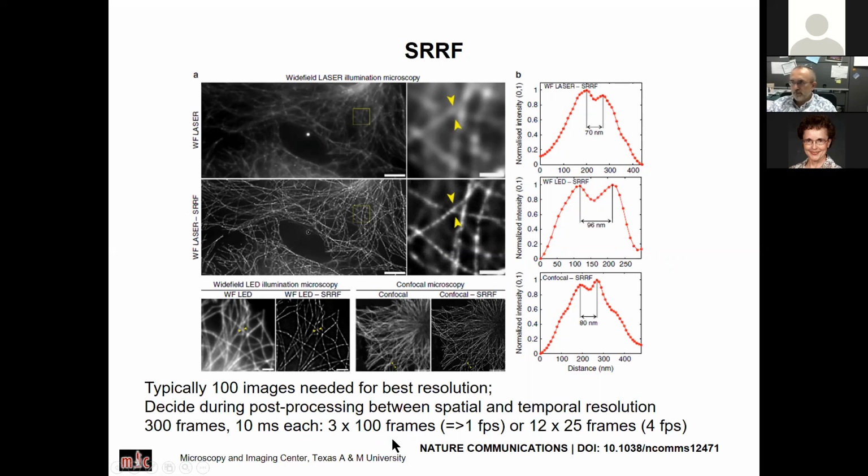So that's SRRF. Some Andor cameras actually have this processing built in, so they give you the super resolution image right out of the camera pretty fast as you're imaging.